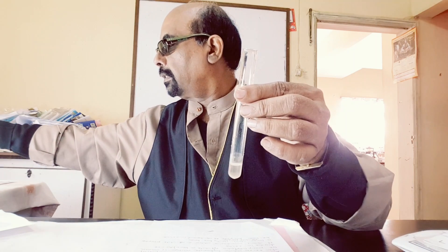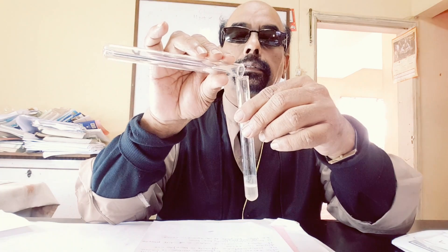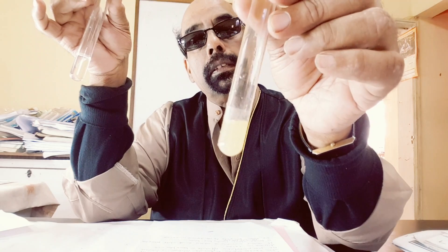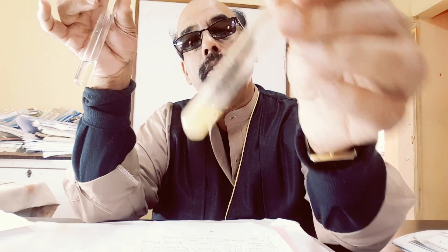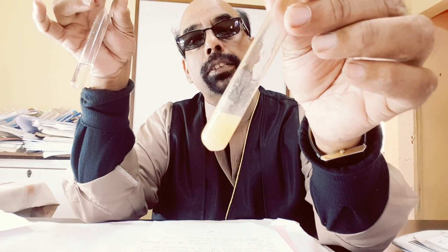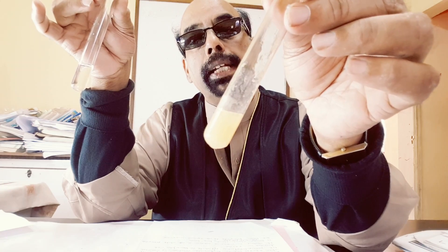I have here a test tube. I am adding a small amount of the manganese solution. To this, I will add sodium hydroxide solution — a small amount. The precipitate formed is white, off-white, and slowly turning brown due to aerial oxidation of manganese 2+ hydroxide to manganese 4+ hydroxide.